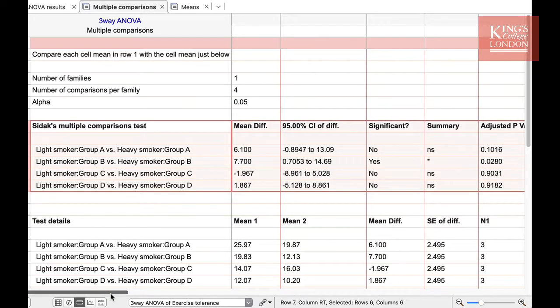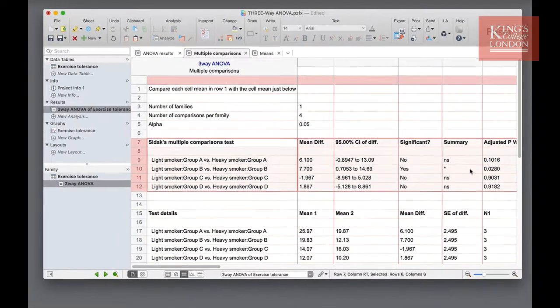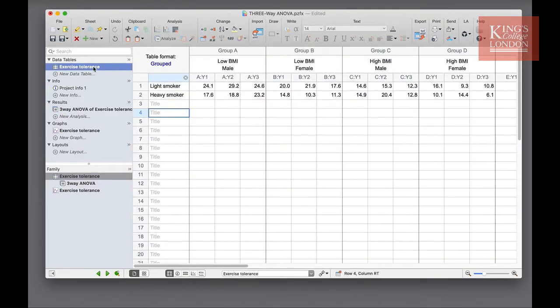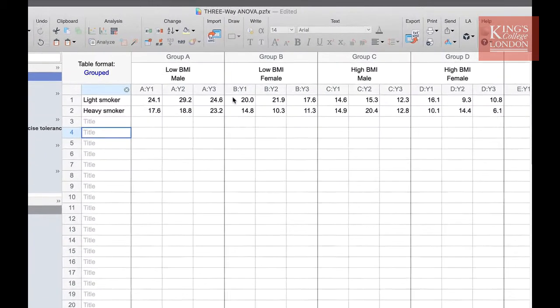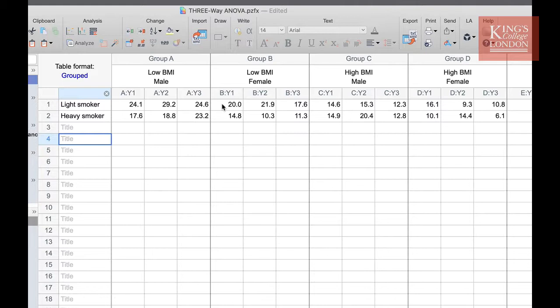You can see that the results of the Sidak multiple comparison test shows that light smoker versus heavy smoker only in group B delivers a p-value of less than 0.05. If we go back to our data table, this means that it's only the light versus heavy smokers in the female population that are showing a statistical difference. So the take-home message from the results of this analysis is that smoking in our study only influenced the VO2 max of low BMI females and has no effect on low BMI males, high BMI males, or high BMI females.